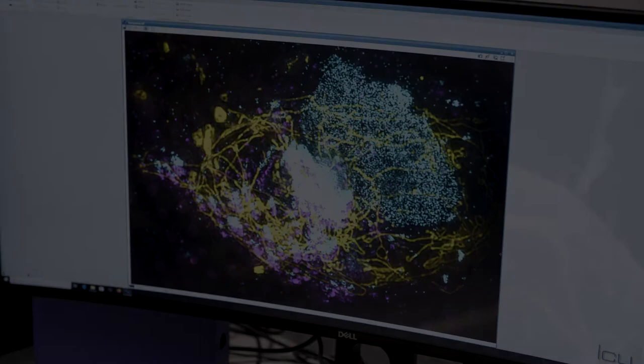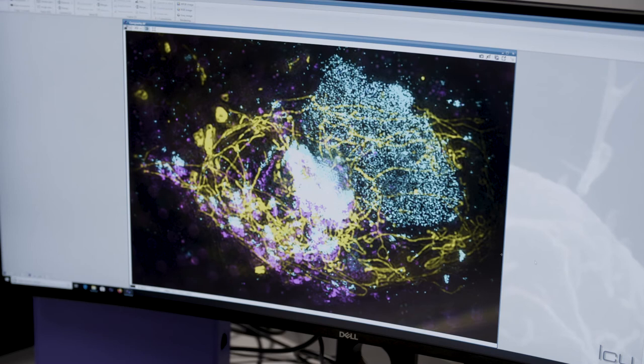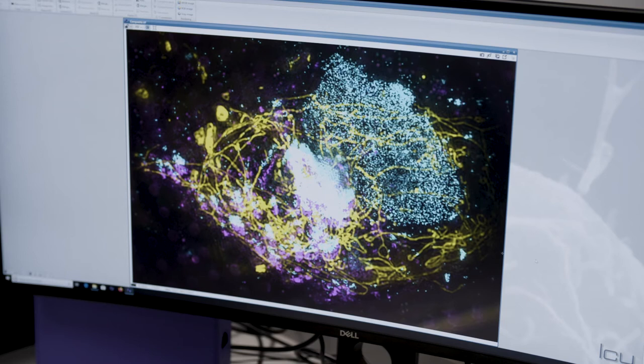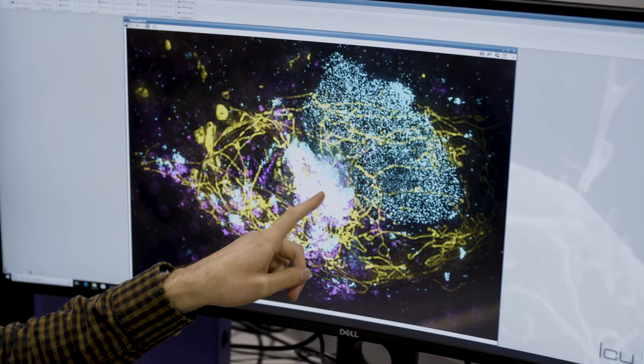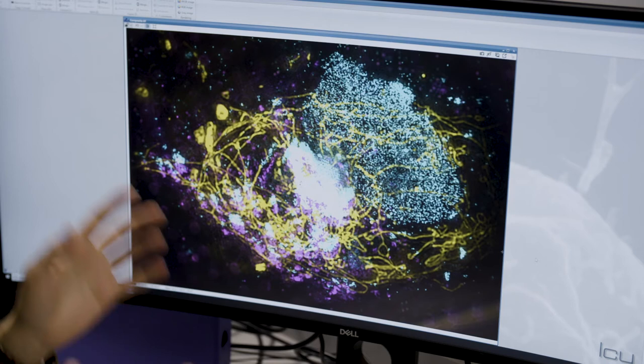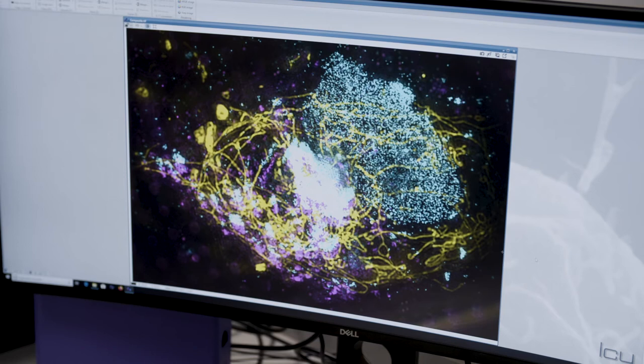This is an infected cell. And you can see several components of infection here. So in the nucleus, we can see immature viral particles in cyan. And then next to the nucleus, we can see these merging with a different viral component in magenta. And this is where we believe mature viral particles are developing. We can also see components of the cell, such as mitochondria in yellow. And that's what these long structures are.